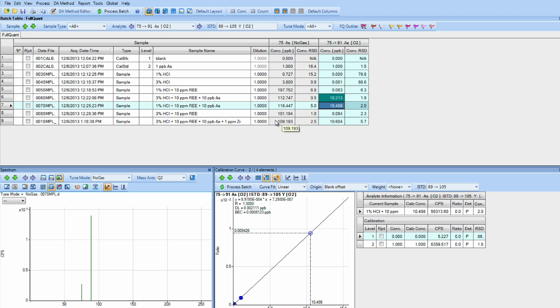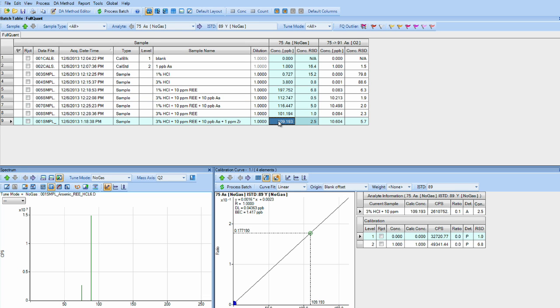And lastly, we've taken the three percent HCl with the 10 PPM neodymium and samarium, along with our 10 PPB arsenic spike, and also spiked with one PPM zirconium. As you can imagine, the 75 mass no gas of arsenic doesn't show the addition of zirconium because zirconium's primary isotope is 90 and 91.